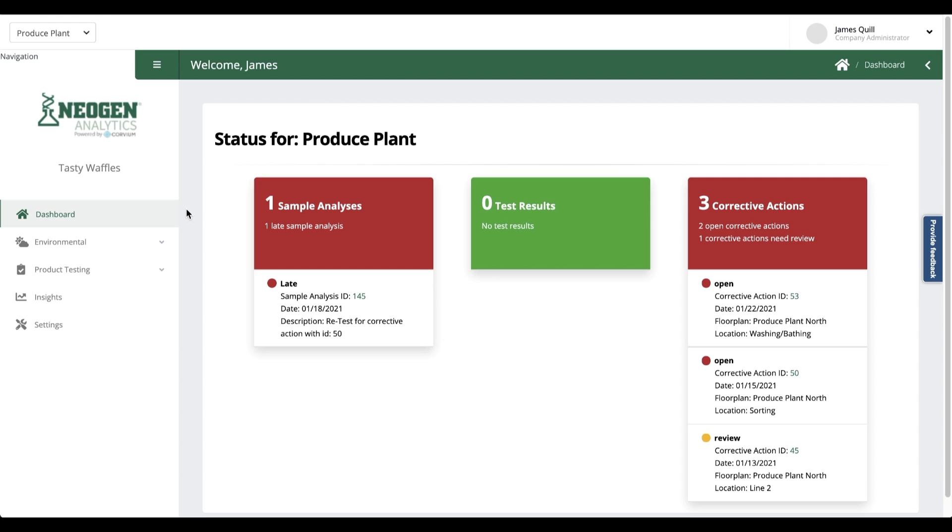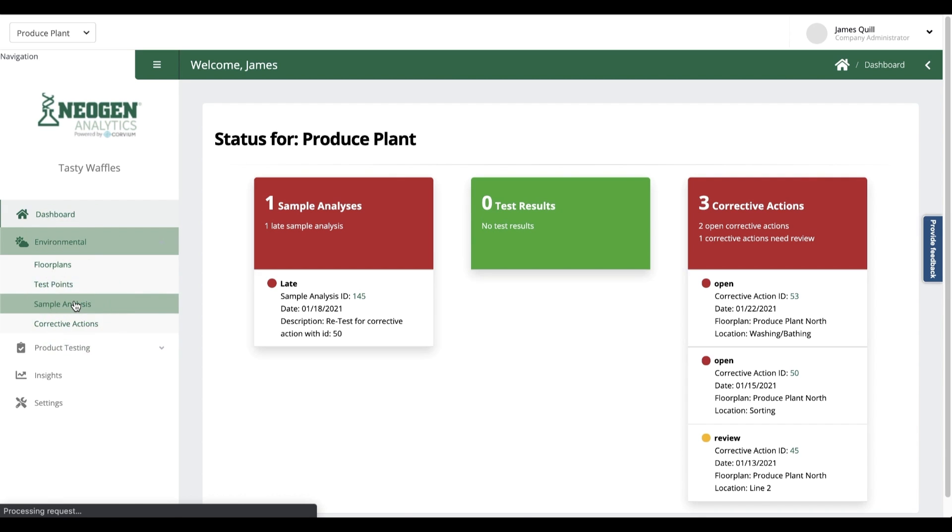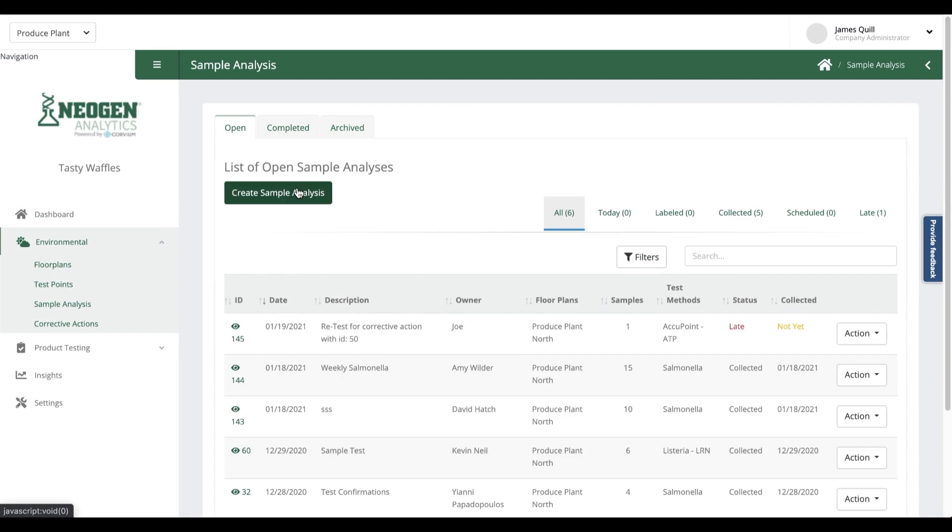For instance, let's say that every Friday before startup, they take 7 random Listeria swabs from Zone 2s within the plant. Let me show you how we can automate that.